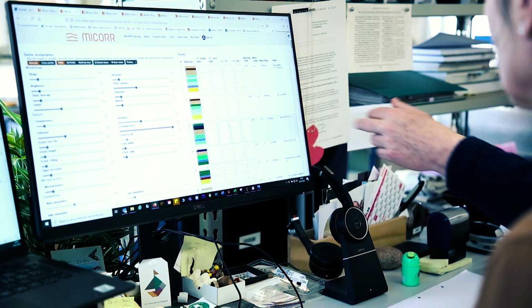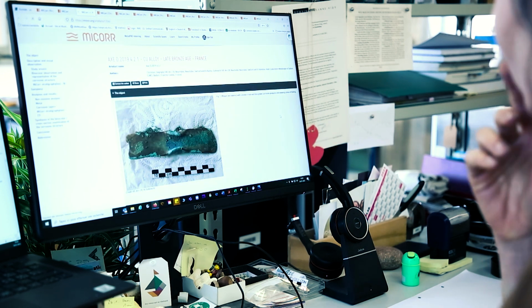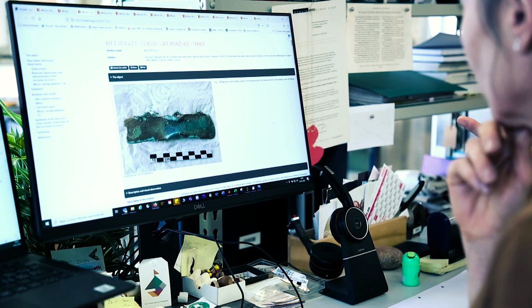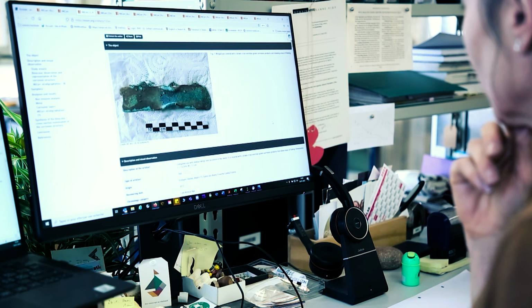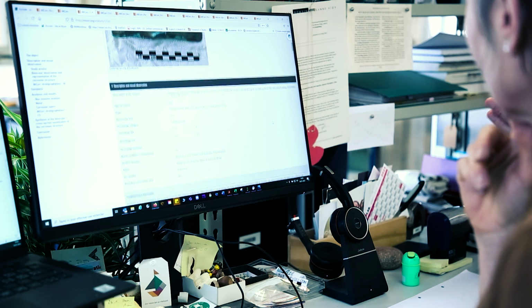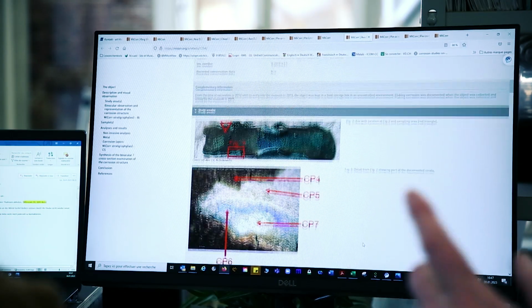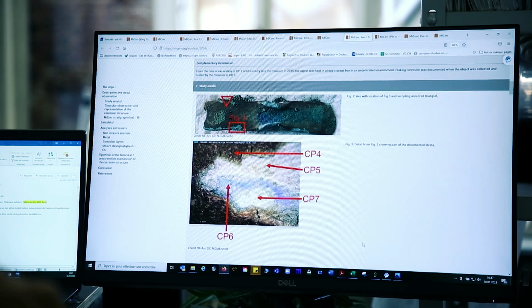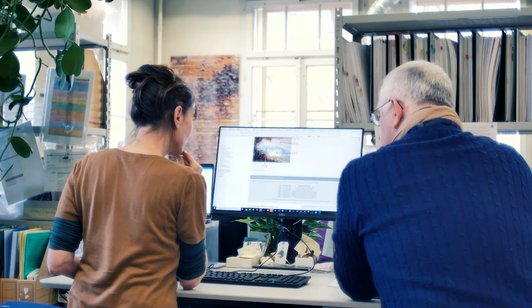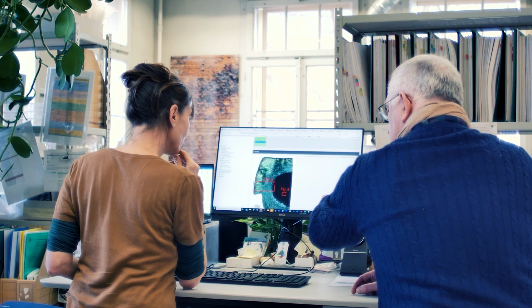So let's have a look at one of them, for instance the axe. In the case of the axe, a sample could be taken. You didn't take any sample, you could not on the object, but here they could. So if you go down, you see that a sample has been taken, so we'll have a look at the sample. Same stratigraphy as yours, we go down again.